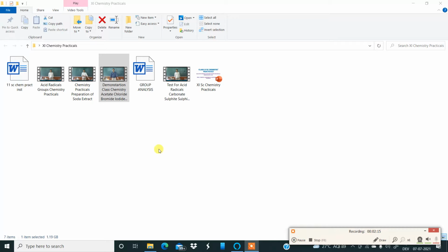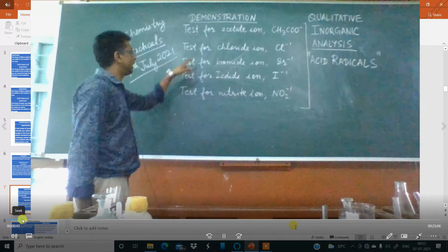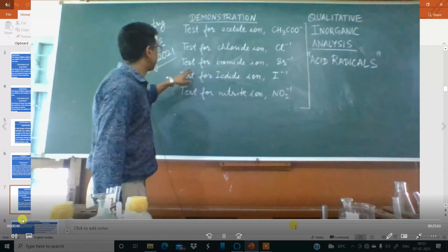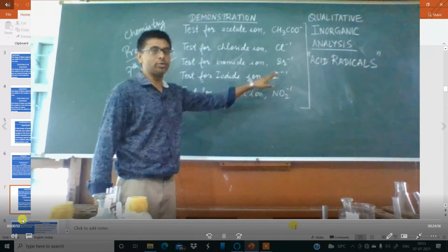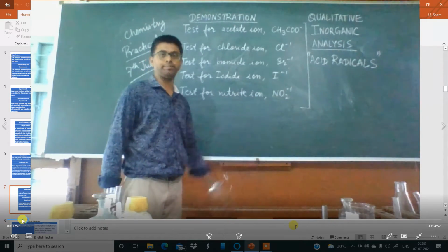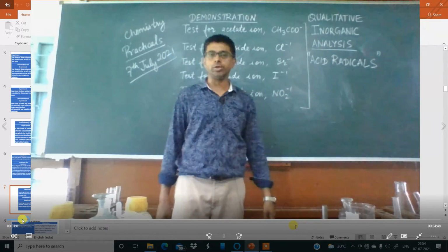So as I was telling you, for the test for acetate ion, as I was showing you in the video, it was somewhere over here. Yes, test for chloride ion, test for bromide ion, test for iodide ion and test for nitrite ion. And the first acid radical which I showed you was test for acetate ion, CH3COO-.